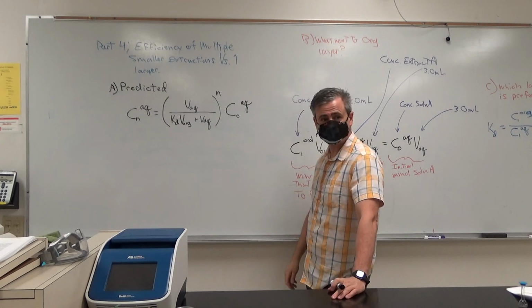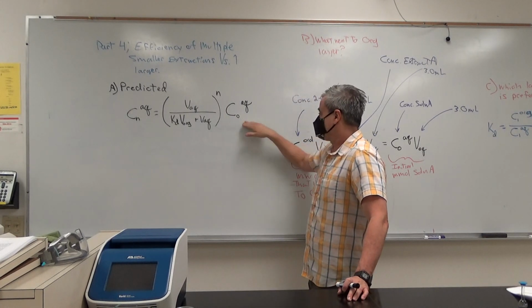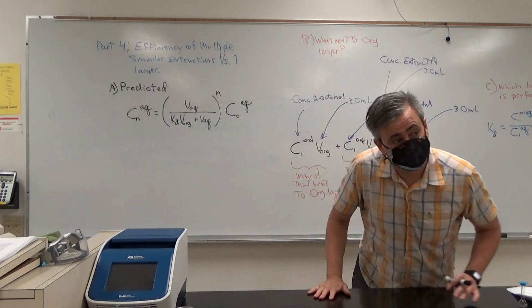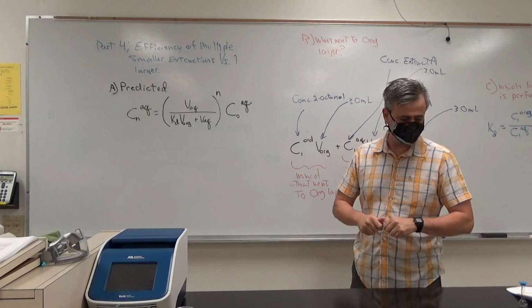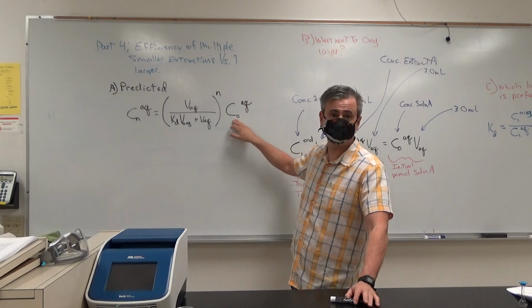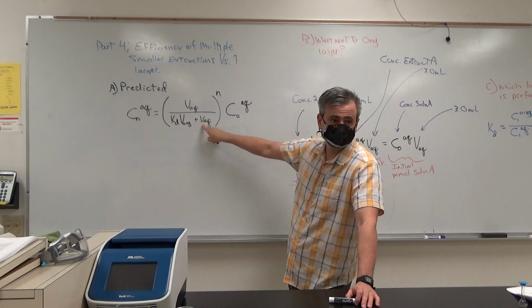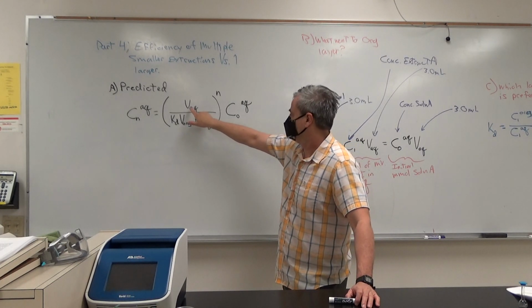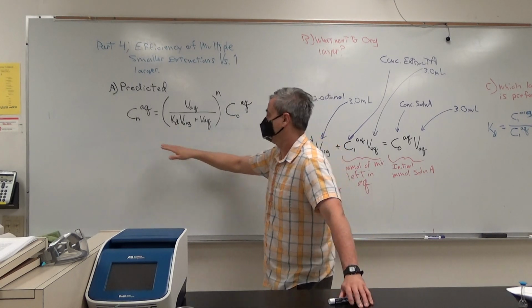Okay, so for what you did in part 3, the extraction, what's n? The number of extractions. It was just 1, right? You did 1. And what is C not aqueous? The initial concentration of the aqueous layer. What phrase are we using to describe that? That's solution A, the concentration of solution A that you figured out way back in part 2. What was VAQ? 3. What was VOR? 3. KD is KD, and that's the concentration that's left.